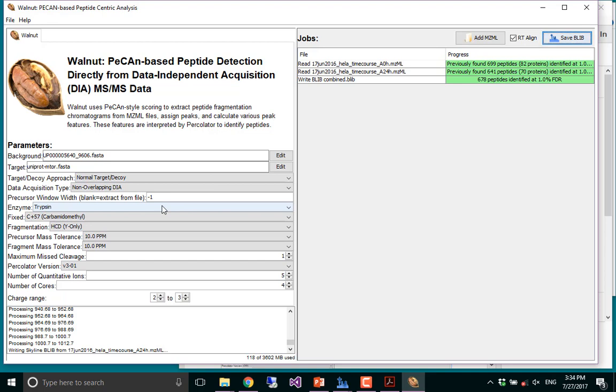Yeah, so that's a good question. So a scoring tool in that situation is going to make a choice. It's going to say this one or that one or that one. And that's kind of where it falls, right? And so if it picks the wrong one, it'll probably get it wrong. So, okay, this is actually a good point. The score is not just a single score. It's actually like 14 different scores, or something like that. And so it uses one to pick the peak, but then it scores using mass accuracy and a whole bunch of other aspects, like isotope dot product. Does it see a precursor, or that kind of thing? And then it creates 14 different scores at that time point, and all of those get passed into Percolator. Okay? And so then Percolator is actually working across a lot more data.